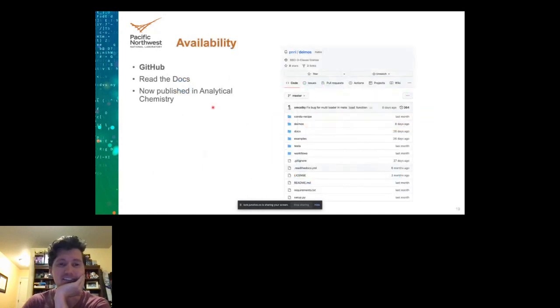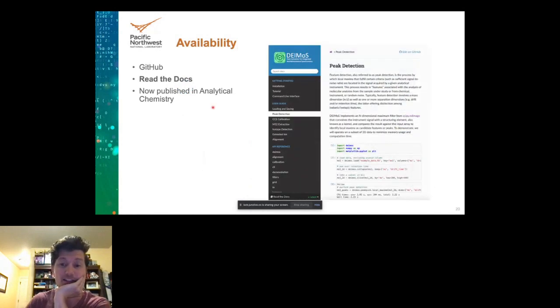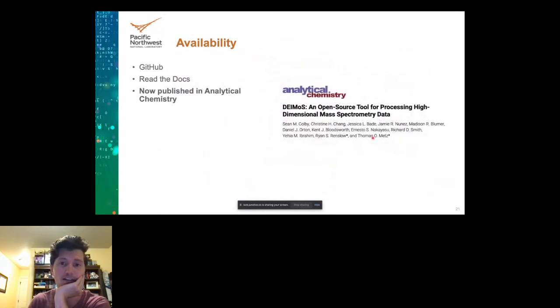So yeah, availability, it's on GitHub now. We have Read the Docs up. Most of these are filled out. A few we still have pending, so a good tutorial on how to use. You can also check out our publication in Analytical Chemistry, just a month or so old now.